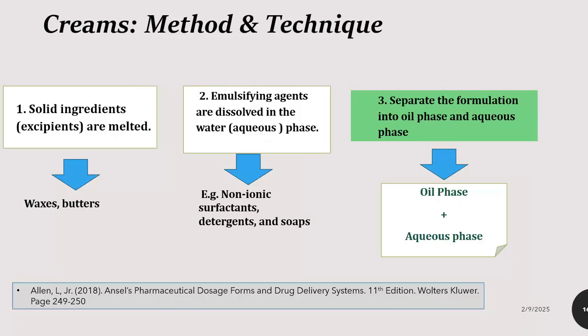Now, when we are preparing creams, we need to appreciate that, as I said before, there's an oil phase and an aqueous phase. The aqueous phase would be carrying or dissolving all your water-soluble ingredients. The oil phase or the lipid phase would be dissolving or carrying your oil-soluble ingredients. It is important for you to look up the characteristics, the physical-chemical properties of all ingredients in your recipe, for you to appreciate the specific roles of your ingredients.